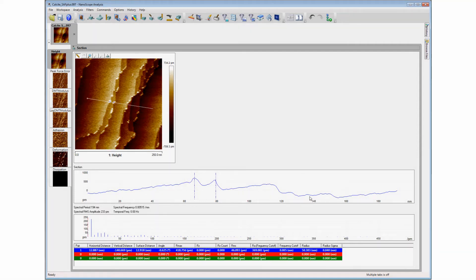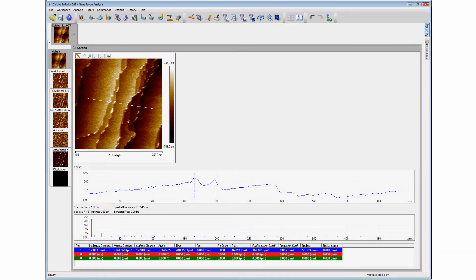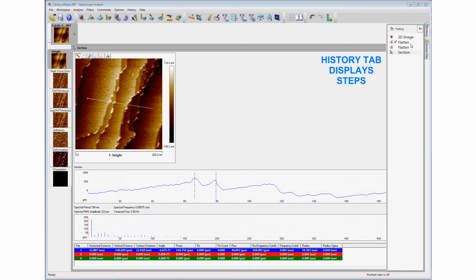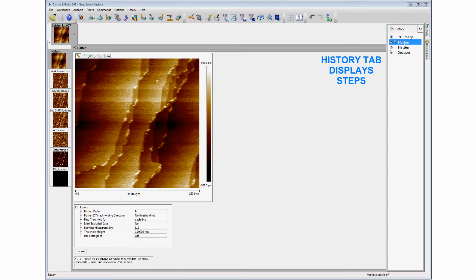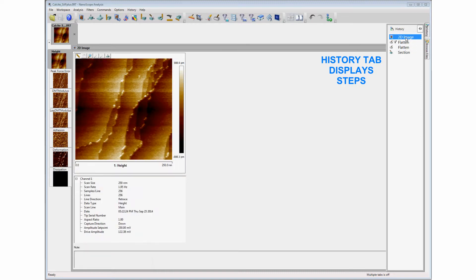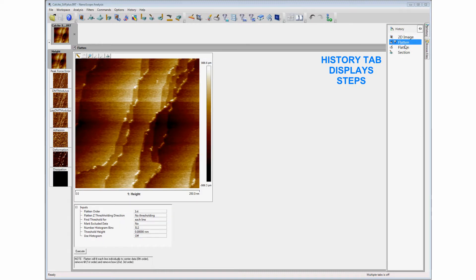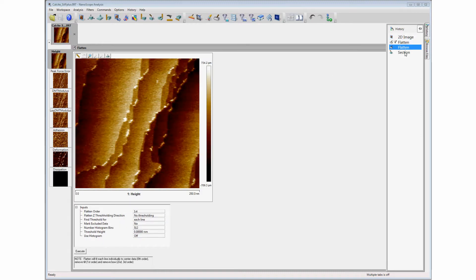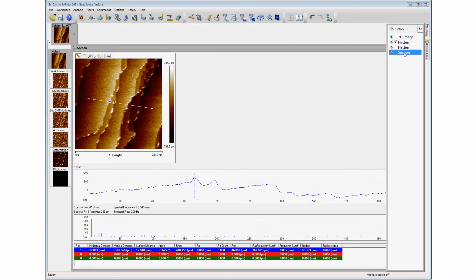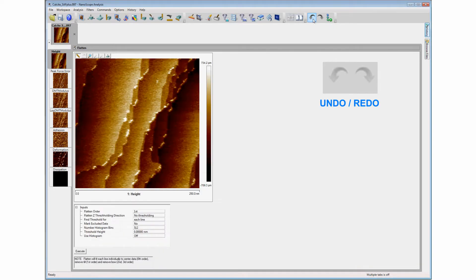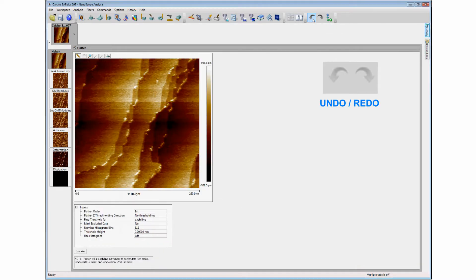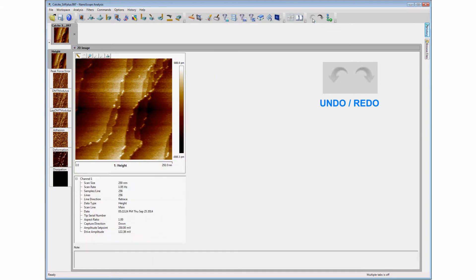The History tab provides the user with an option to go back and forth through a series of processing steps to view the changes. The Undo command also reverses the action previously taken to a point that the user may prefer to keep before making different choices.